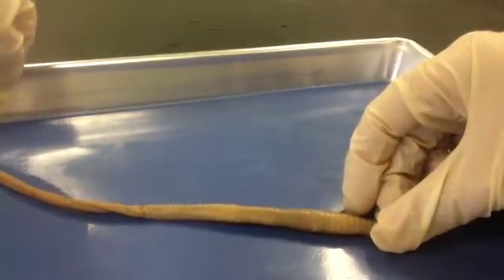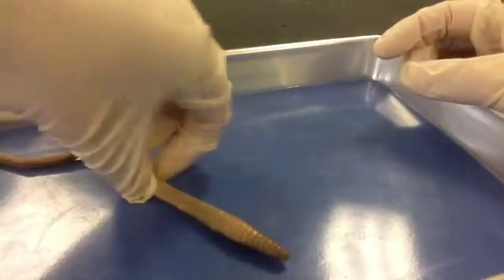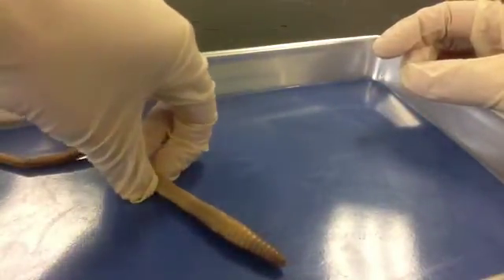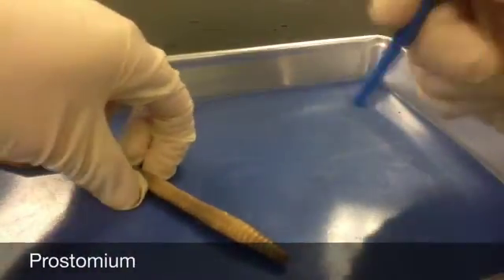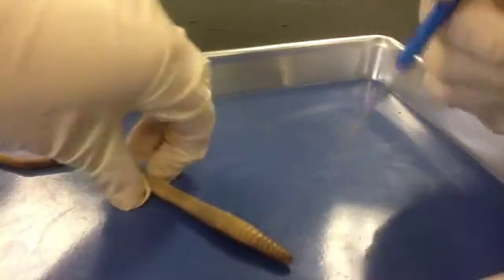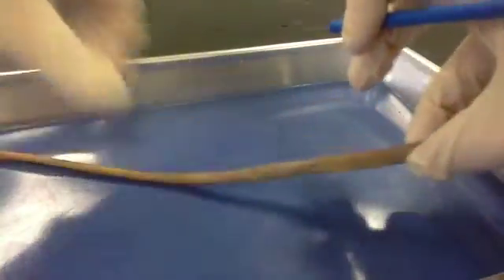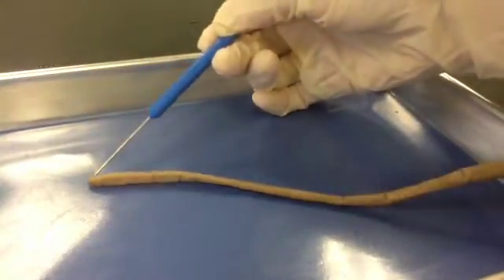The first thing we want to do is find the anterior, or the head, of our earthworm. You can find this by looking for the prostomium, which is going to be this fleshy lobe — let me point it out for you — right here, that's going to extend over the mouth. And the other end of the worm is going to be our posterior end, where the anus is located.